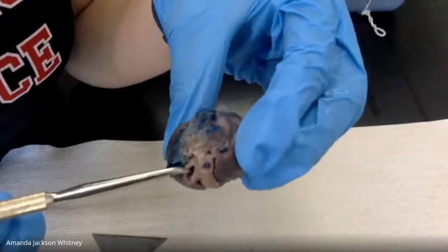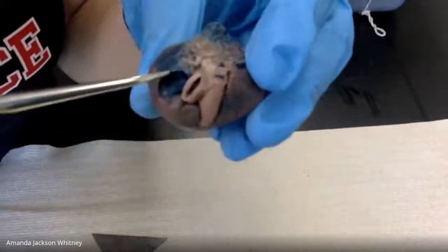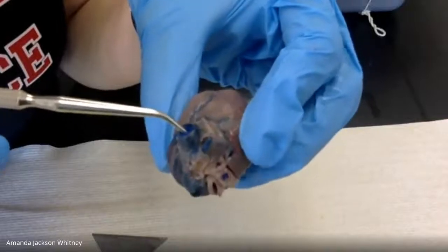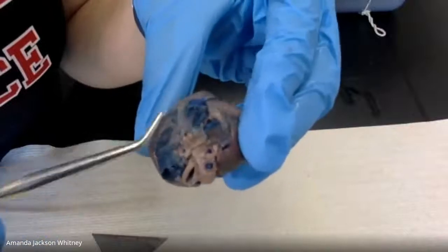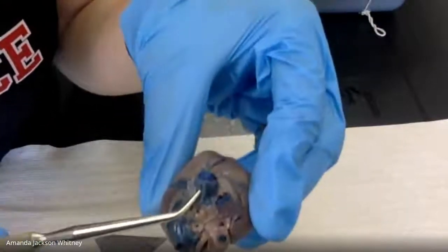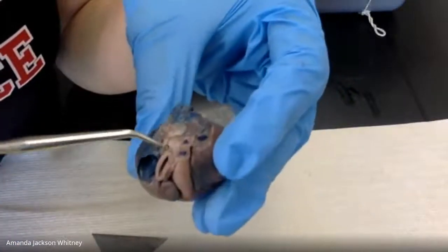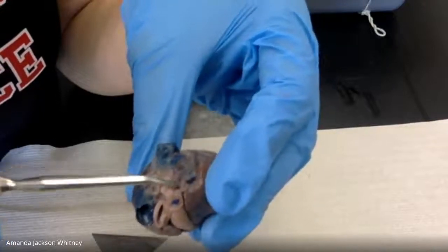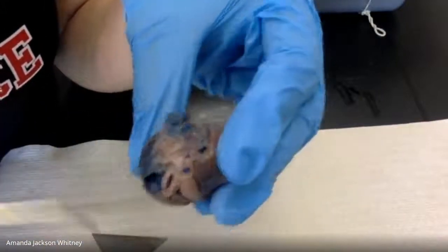Yeah, exactly. Arteries are thicker than veins because they need to be able to withstand more pressure. So some of the main blood vessels: vena cava, aorta. This is the inferior vena cava, which on the pig is positioned a little bit differently because of their positioning as quadrupeds versus bipeds. But very similar still to humans. And then all of these smaller ones, we're not going to be able to distinguish between these, but these are all those pulmonary blood vessels that are bringing blood from the heart to the lungs or back in.